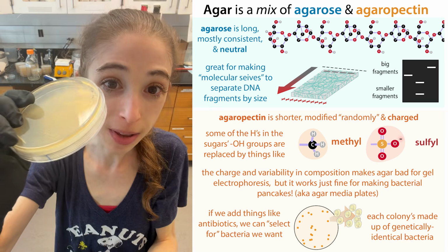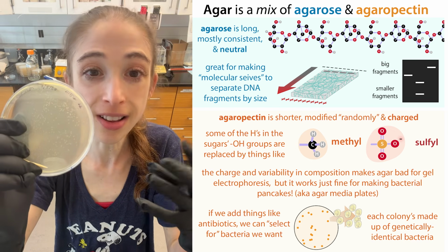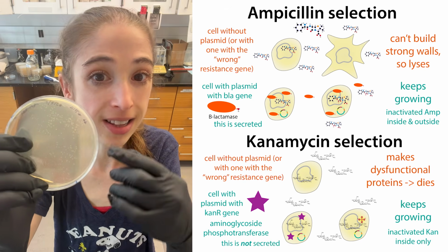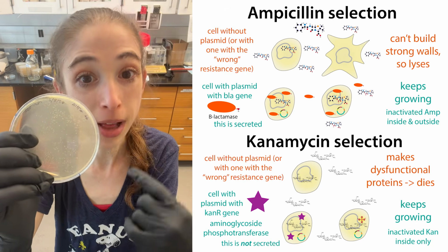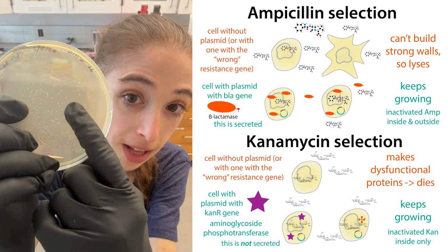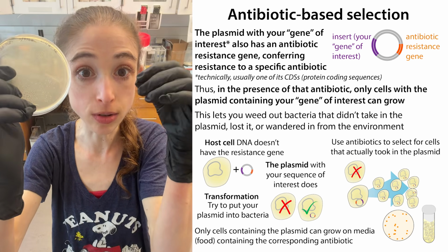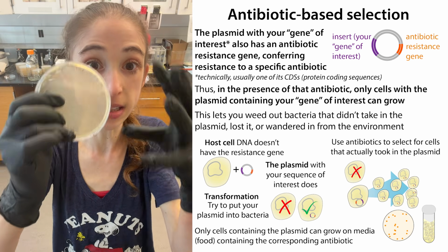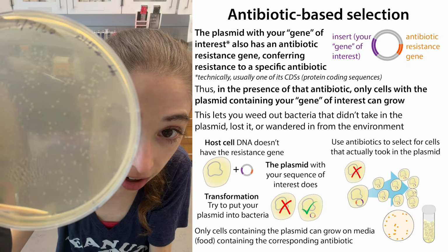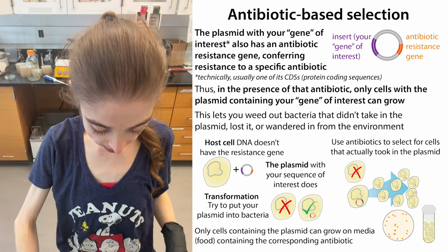In these plates, we have LB agar, which is basically bacterial food in a gel, and then it also has kanamycin, the antibiotic that the bacteria that have the plasmid will be resistant to. The bacteria that actually took in that plasmid will plop down on the plate and start growing, making copies of themselves upon themselves. And so you get these gloopy dots called colonies, and you want to see them nice and spaced apart and kind of big.